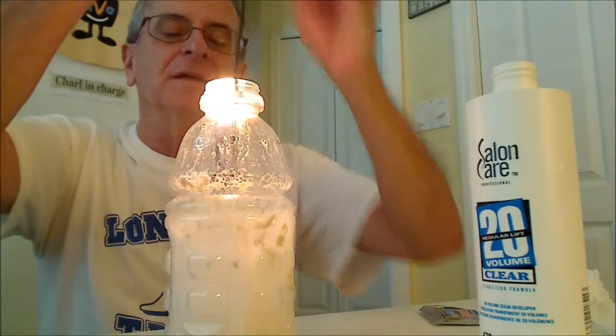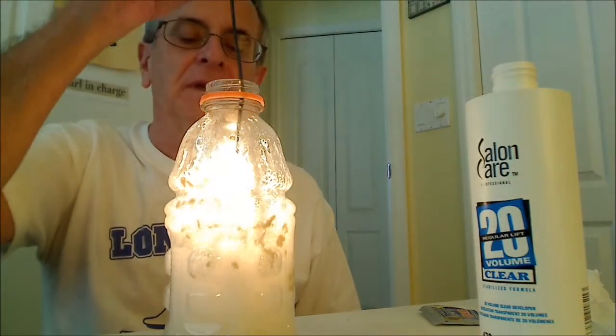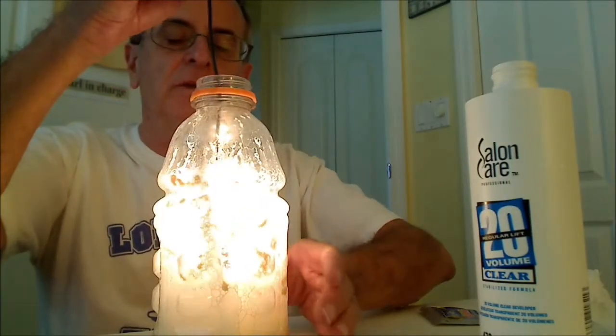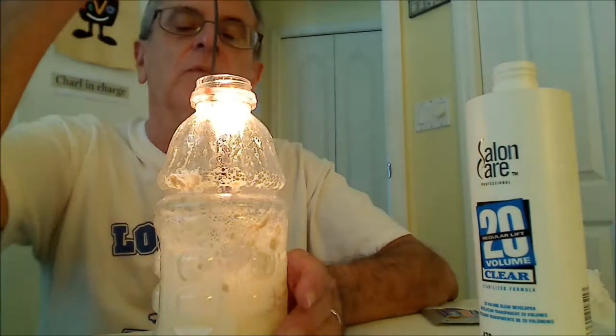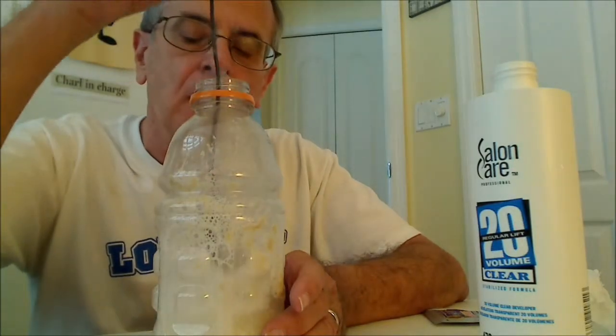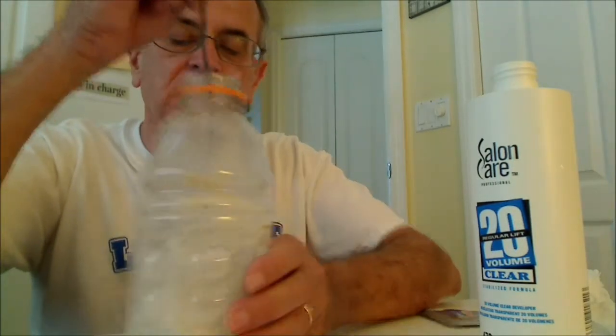So this is another take on a nice demonstration. I would suggest using a 3% household hydrogen peroxide — it works fine. I guess it's pretty much reacted.